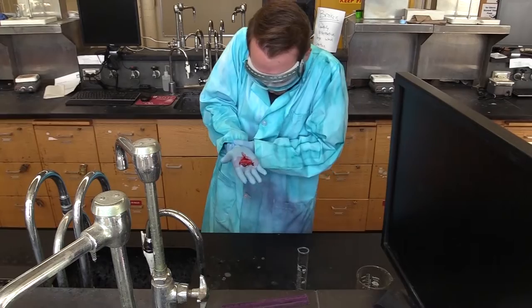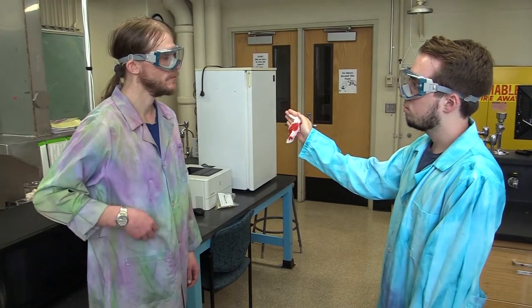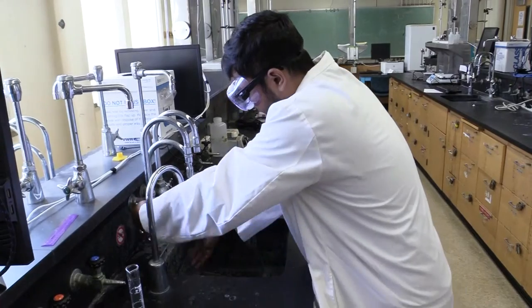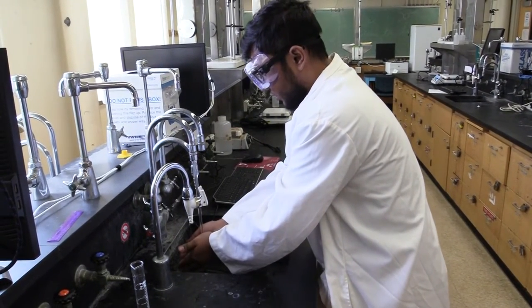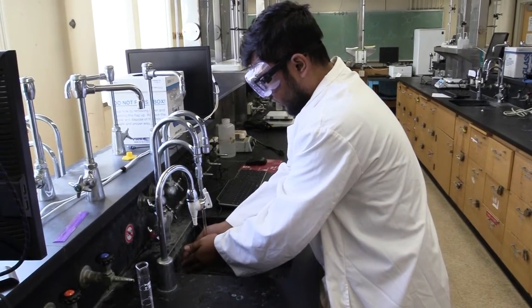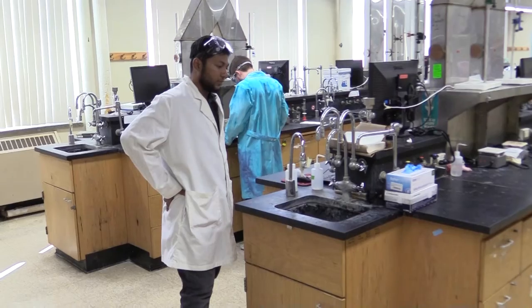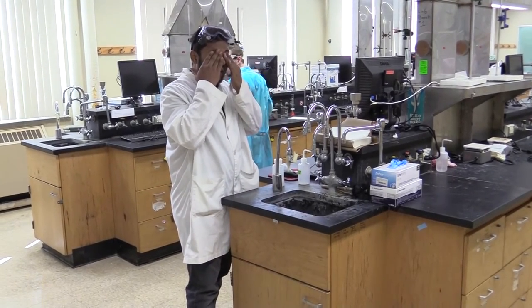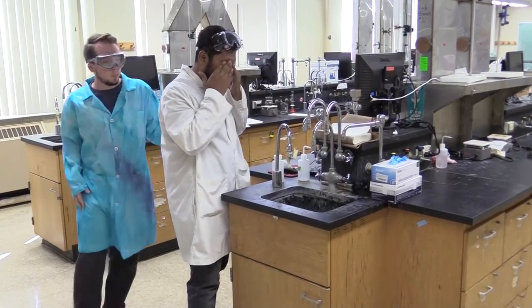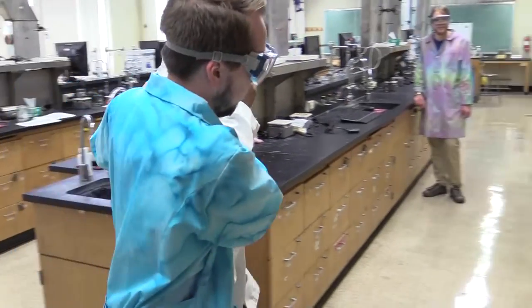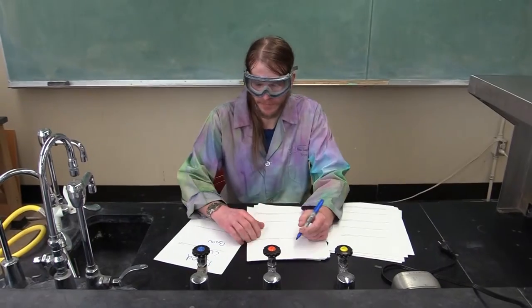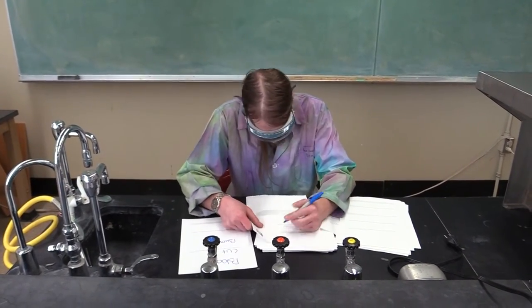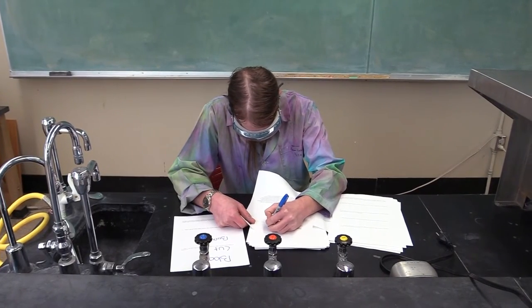So what do you do if you get a cut or a burn? If you're cut, first let your TA know and they will help you deal with it appropriately. For small cuts, we have band-aids in the first aid kits we can give you free of charge. If you're burned by something like a hot plate, place the affected area under cool running water for at least 10 minutes or until the pain subsides. If you're burned by a chemical, get it under cool running water and hold it there for at least 15 minutes. If you get anything in your eyes, get yourself to an eyewash station right away. If you can't see, say something so that somebody nearby can help you. Always notify your TA whenever you cut yourself or burn yourself or if you had to use the eyewash station.